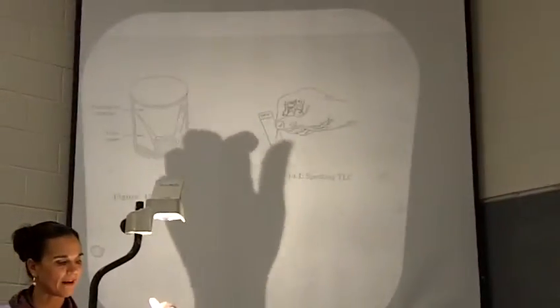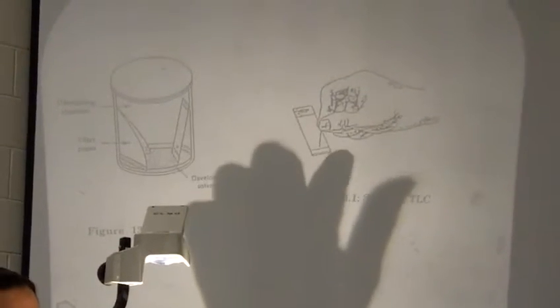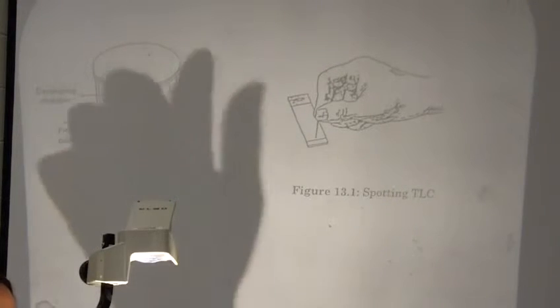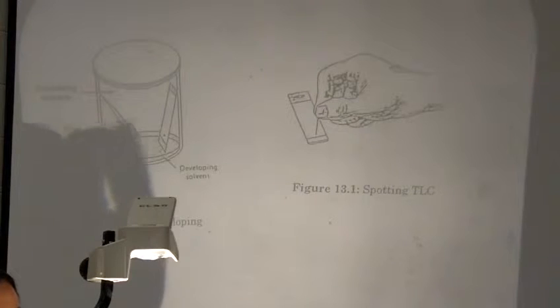And so, the basic principles involved. This is a drawing of a TLC plate. You will have plates that have lines in pencil on the bottom. That's where you will be spotting from your reaction mixture, and then we'll be putting them in glass jars that will be used as our developing chamber.